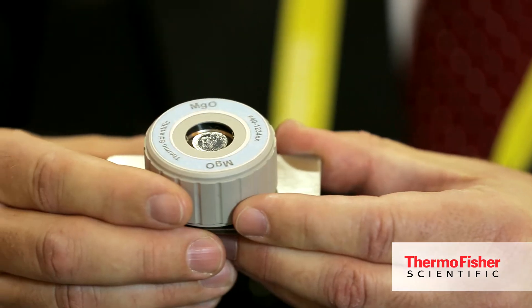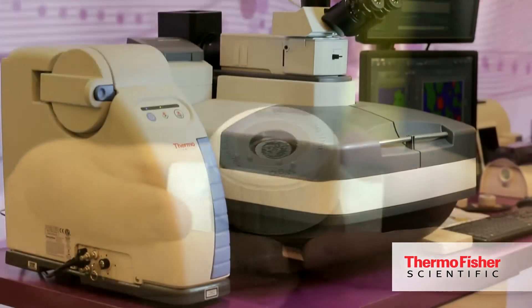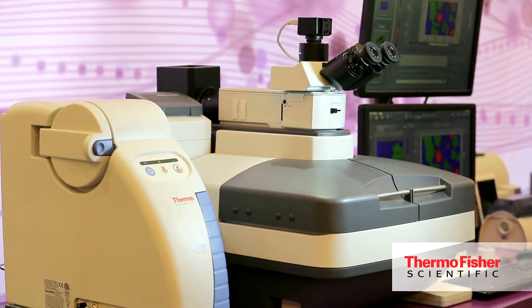They want to keep it in the same state it was in the battery when it finished up. So what we first developed is this air-sensitive cell. They can take the cell into the glove box, take the battery component in, mount it inside the cell itself, then seal the cell up and bring it out. It maintains the inert atmosphere in the cell, and then it can go into the instrument so they can benefit from doing the Raman imaging.